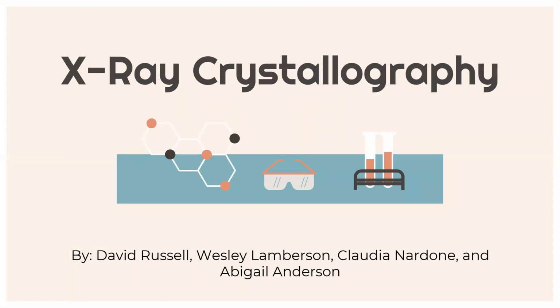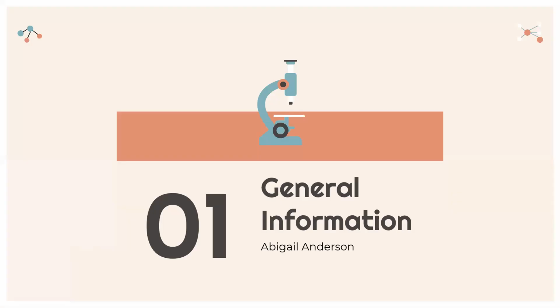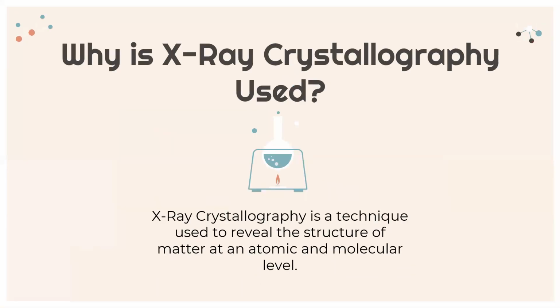So the instrument that our group had assigned was X-ray crystallography, and the members of our group are David Russell, Wesley Lamberson, Claudia Nardone, and myself, Abigail Anderson. So the 4 parts that we'll be going through are general information, the functions of X-ray crystallography, performance information, and real-life applications of this instrument.